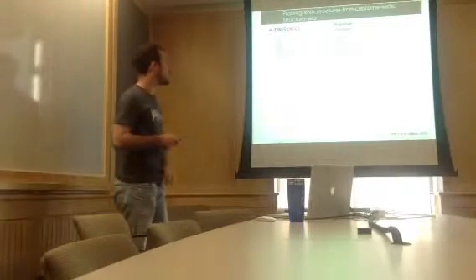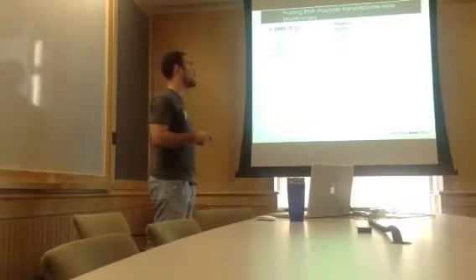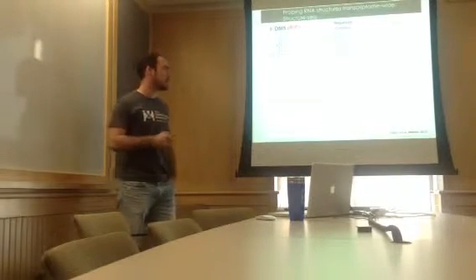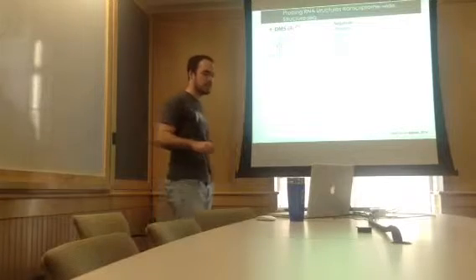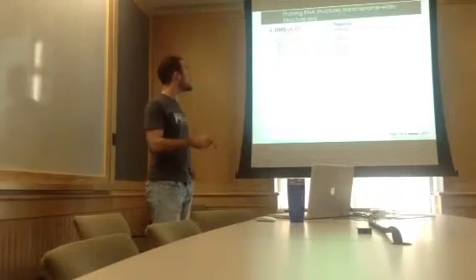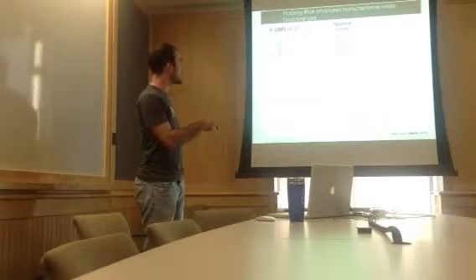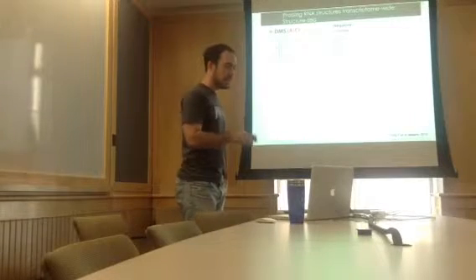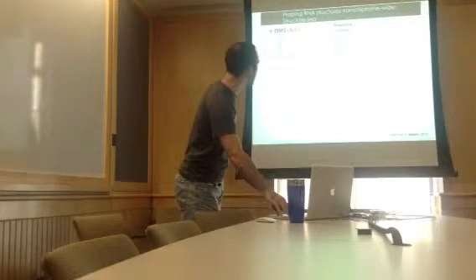So during my first year, I developed a technique that is really similar to what the Bevilacqua and Assmann lab reported last October in Nature, and they call it Structure-seq. So I will use the same nomenclature. So in Structure-seq, you have an RNA modified with DMS and a negative control where we have no probing reagent.